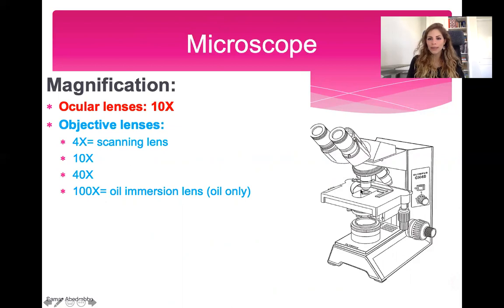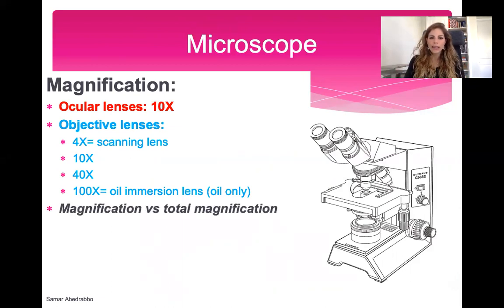You will never use this objective lens without oil because, okay, we tell students that you'll smash the slide, but the other main reason is that you get better resolution. You actually can see what you're looking at using oil.